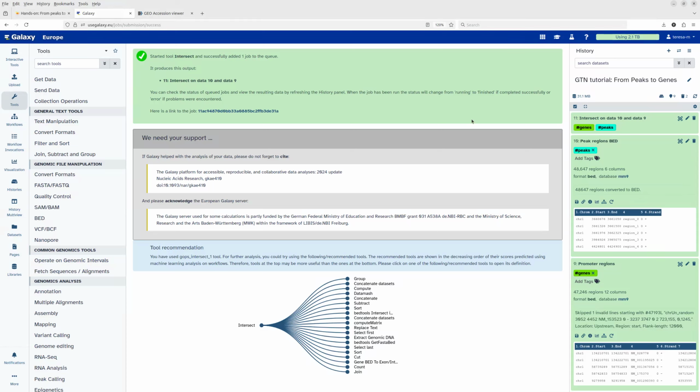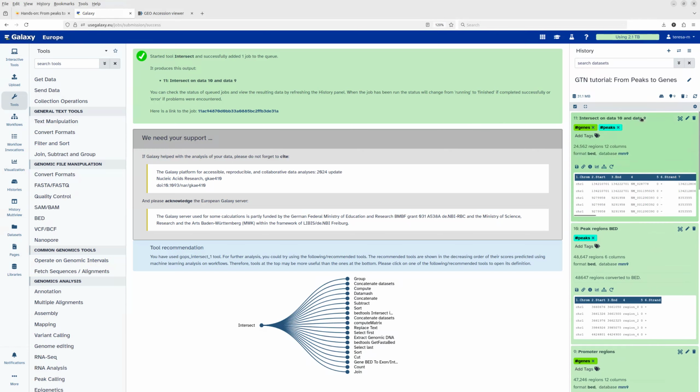And with this output, you now have finally a list of gene names where you know those genes overlapped with the original peak region files. So you have some material detected on these genes. And this is important because you may want to research further or ask many different questions regarding those genes that were found. So from now on, a more in-depth analysis could start.